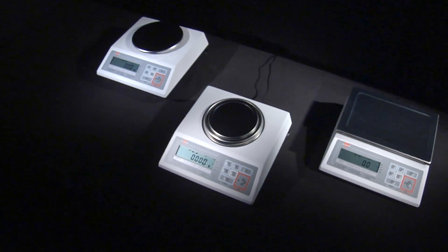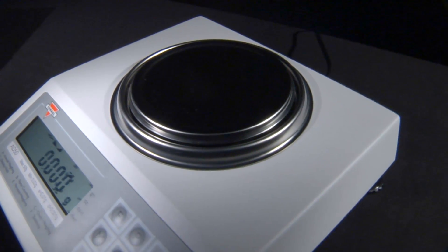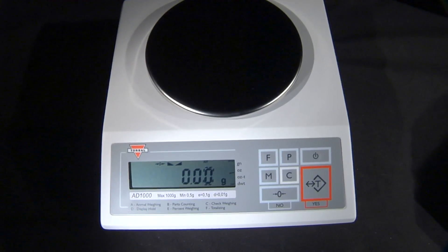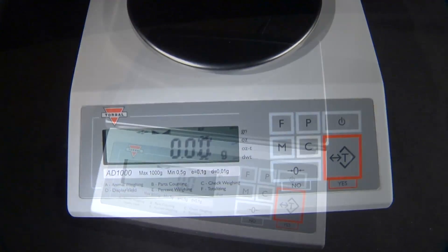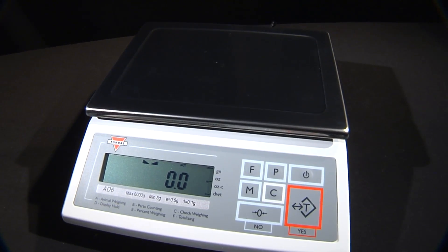The Torbal AD line includes models ranging in capacity from 50 to 500 grams with a resolution of 1 milligram, 1,000 to 3,000 grams with resolution of 1 hundredth of a gram, as well as a 6 kilogram model that has a resolution of 1 tenth of a gram.